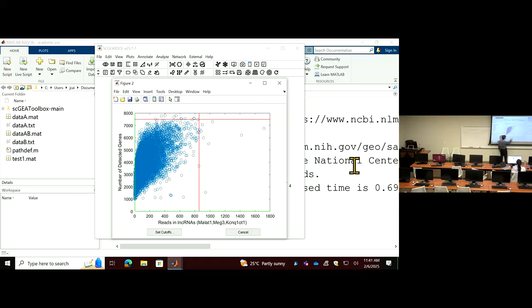For some reason, for the combinations of those long non-coding RNAs, you see these cells, for example, have quite a lot of those reads, which are not in the normal range. We don't know exactly what happened in there, but this is empirical evidence. If you remove those cells, it will be good. So we keep this the same, but maybe we remove some of those long non-coding RNA enriched cells.